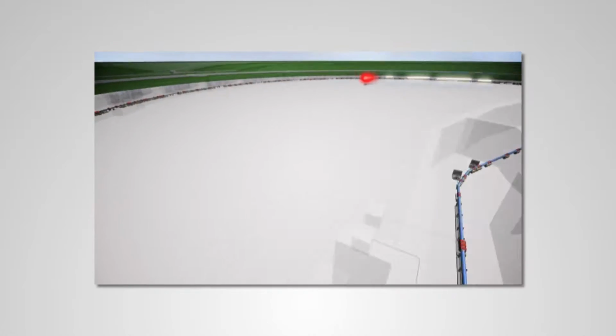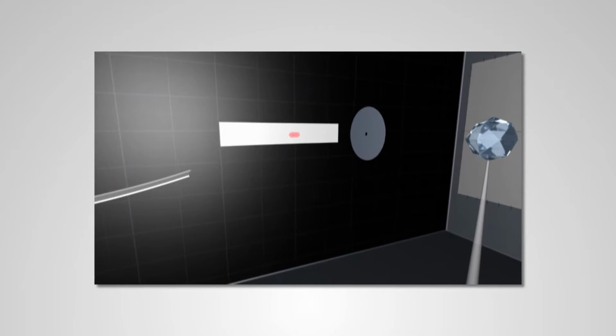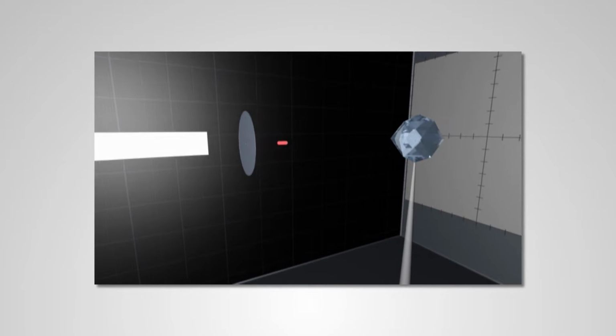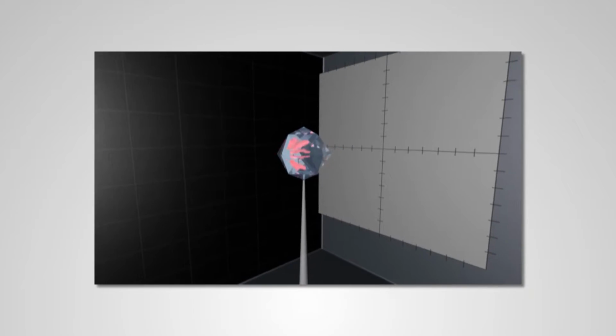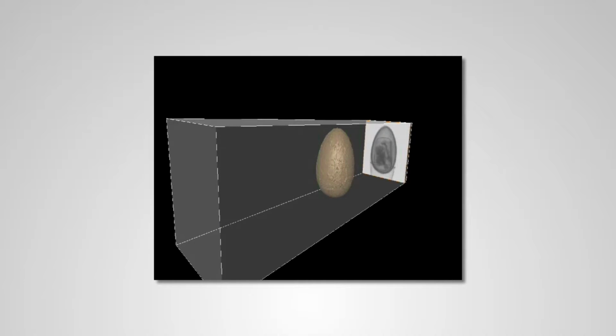These X-rays can be used in many different ways, mostly to understand the atomic and molecular makeup of materials. Research in medicine, chemistry, material science, and physics is all made possible by illuminating samples with a brilliant light made by Diamond. X-ray computed tomography uses the X-rays from Diamond to look at projections through the materials we're studying.